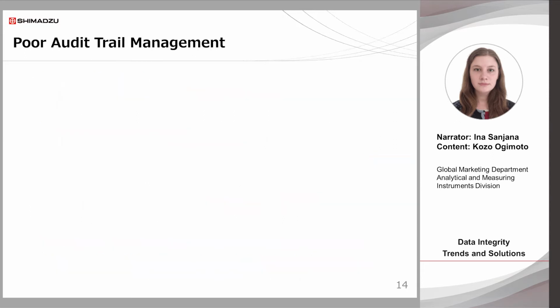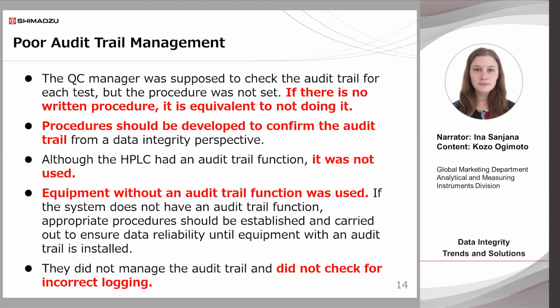Here are some problems that have been observed relating to audit trails. The first issue was that the procedure for checking the audit trail was not fixed. This led to the strong statement that if there is no written procedure, it is equivalent to not checking an audit trail. That is, it is not enough to keep an audit trail. Recently, it's required to have the audit trail checked and reviewed according to a set procedure. This is to ensure data reliability by checking for any mistakes during testing.